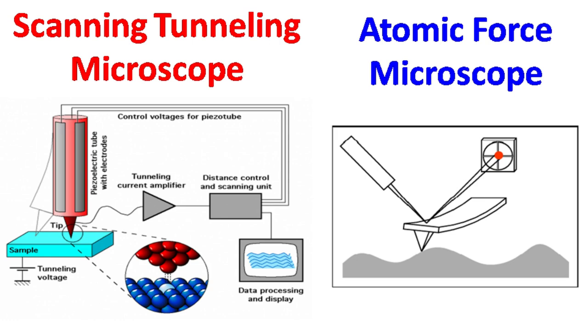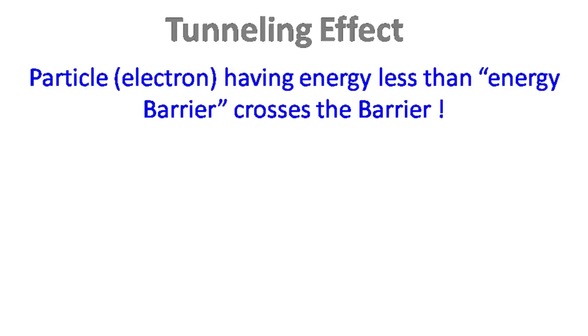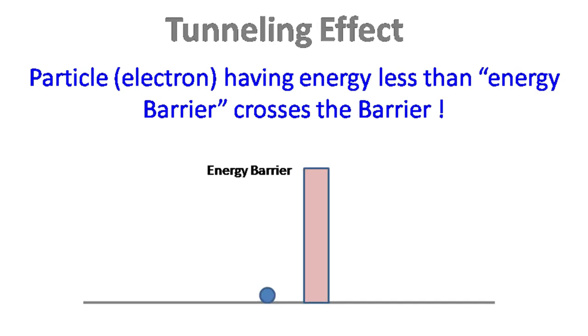So today I'll be talking about scanning tunneling microscope and atomic force microscope. The scanning tunneling microscope works on the principle of tunneling effect. The tunneling effect is the quantum mechanical phenomenon in which the particle having energy less than the height of energy barrier crosses the barrier.